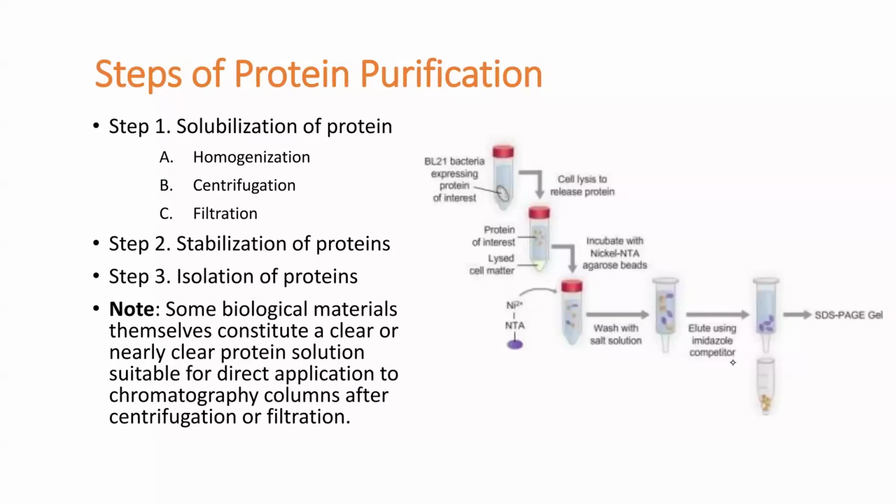After you homogenize, you have to lyse the cell, because after you homogenize the cells you are going to get different components of the cell.